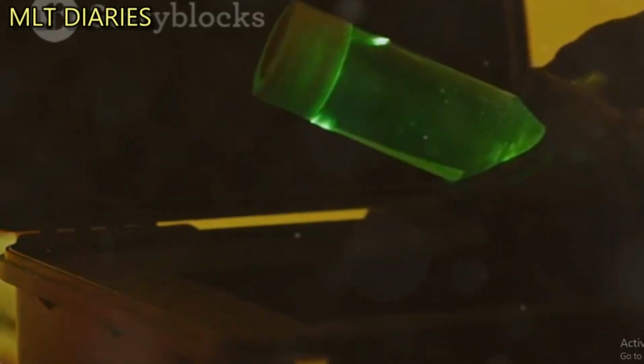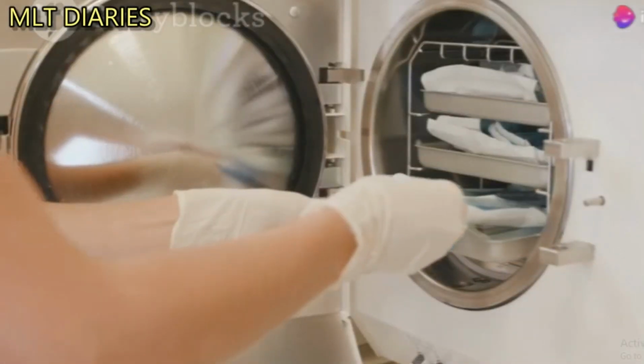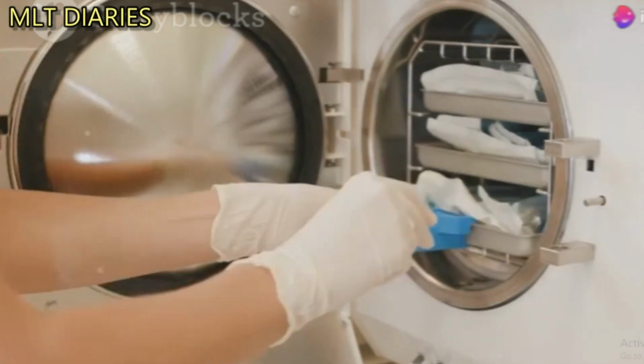Waste management is also key. Follow the guidelines for segregating, packaging, and disposing of laboratory waste. Use autoclaves and other decontamination methods as specified.